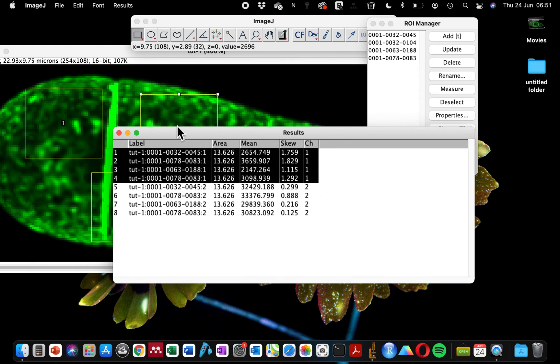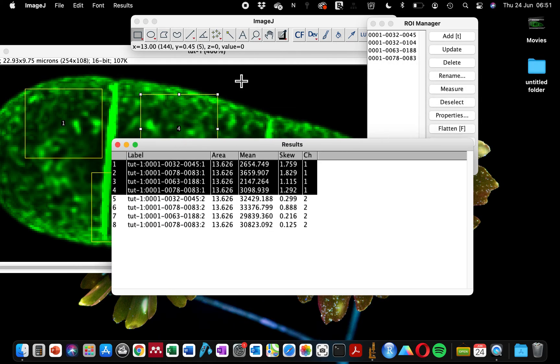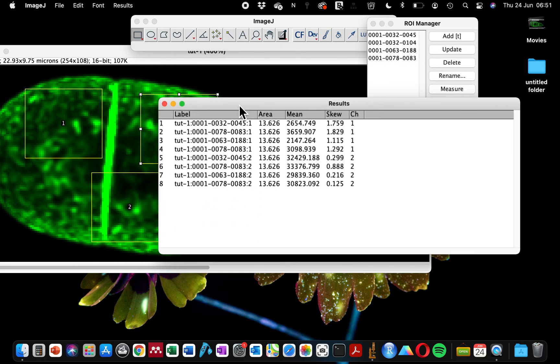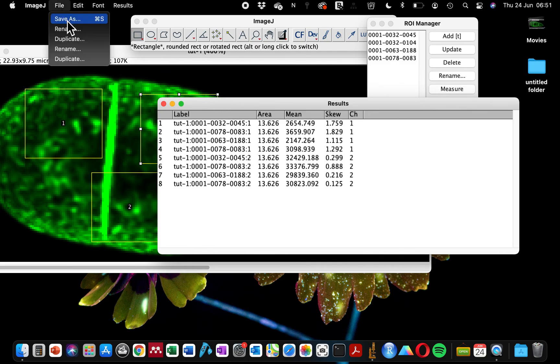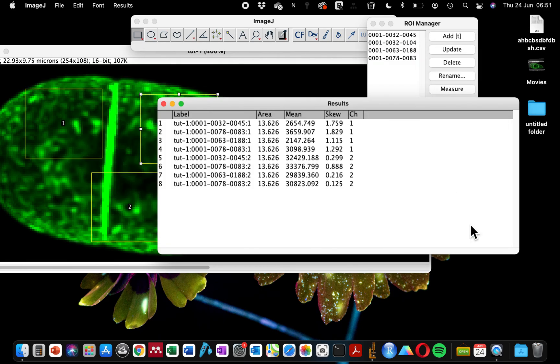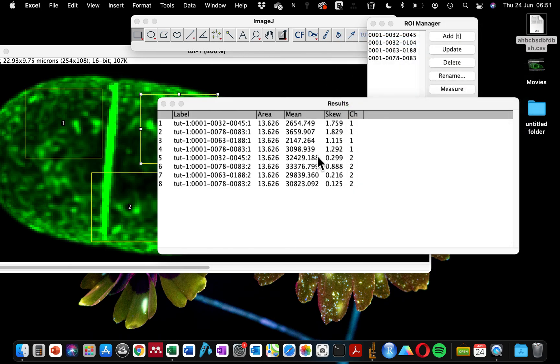If you want to export the four different intensity values, go to File > Save As from the measurement panel. This will export the values in CSV format. Just click to save it to the desktop. Now you can open this as an Excel file and continue your analysis.